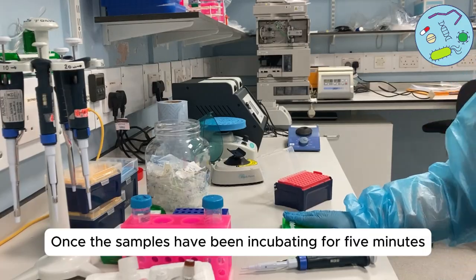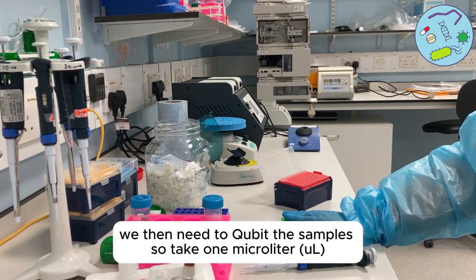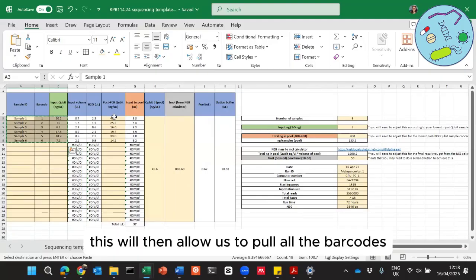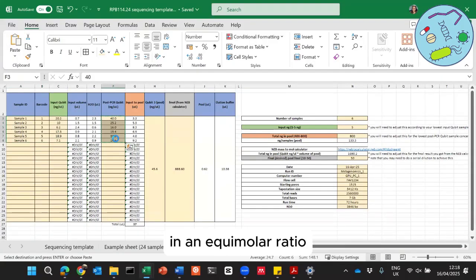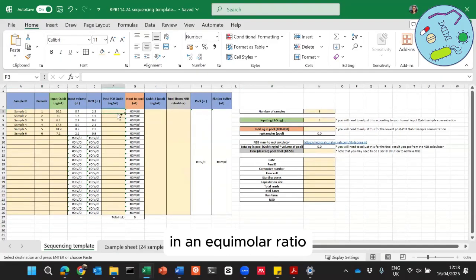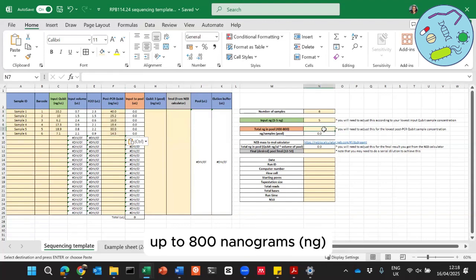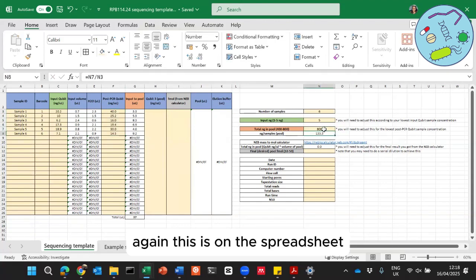These need to be incubated at room temperature for 5 minutes. Once the samples have been incubated, we need to Qubit the samples — take 1 microlitre and identify the concentration. This will allow us to pool all the barcodes in an equimolar ratio, up to 800 nanograms. This is on the spreadsheet — you can see in red the input to pool column and the total nanograms that you want to put in your pool.